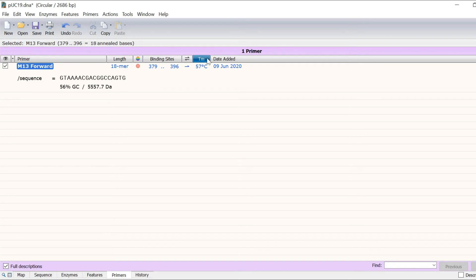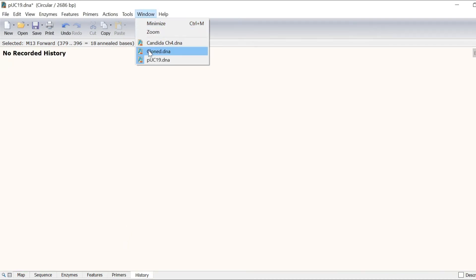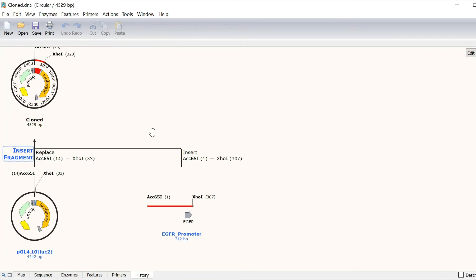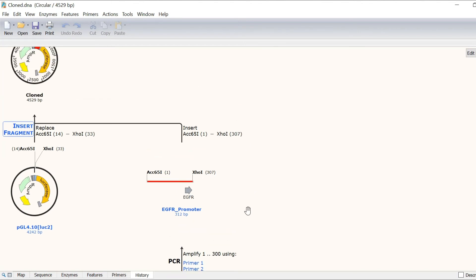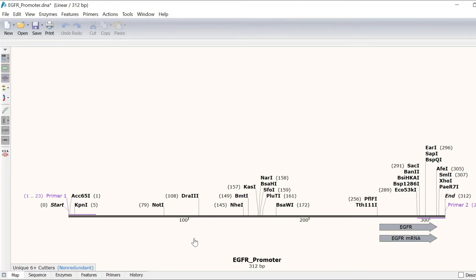For projects involving one or multiple steps, you can see an automatically generated graphical history of your DNA constructs in the history tab. For example, in this file, you can see that I simulated PCR to add two restriction sites onto an EGFR promoter, which was then inserted into a PGL4 plasmid containing a luciferase reporter. I can easily recover ancestral sequences as a separate file by simply clicking on them.